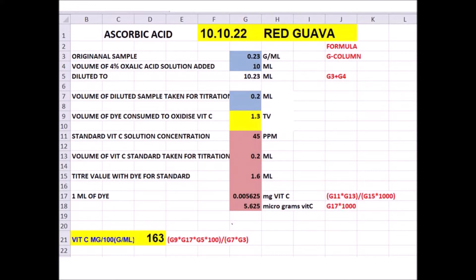In the Excel program, the original sample weight should be typed in column G, row 3. Here it is 0.23 grams. Next, the volume of 4% oxalic acid solution added to the sample for extraction — 10 ml — goes in G4. So automatically in G5, the program calculates G3 plus G4, giving 10.23.